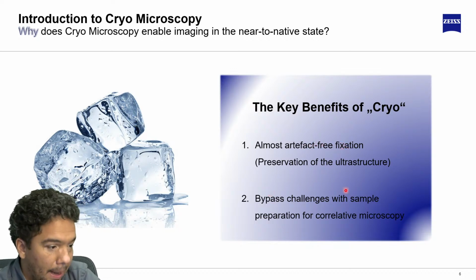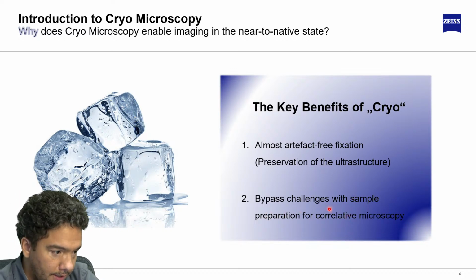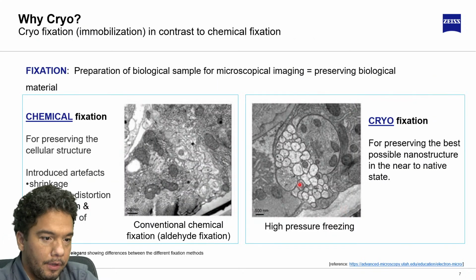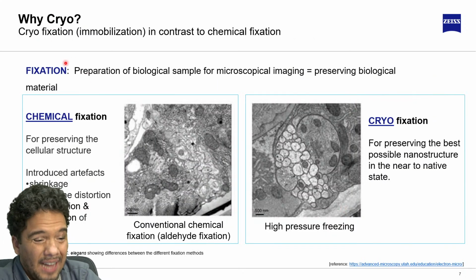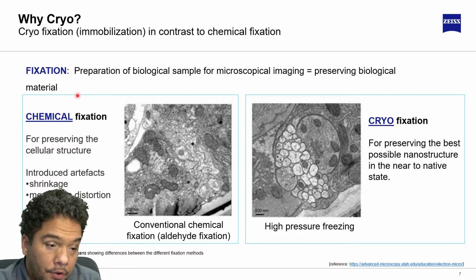And of course, we bypass challenges associated with the sample preparation for correlative microscopy here. That is so important.